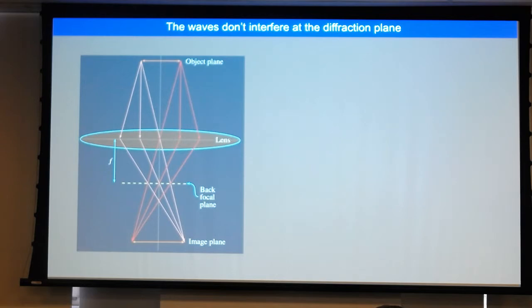Of course, when you run the microscope in diffraction mode, what happens is that you have another lens down here that focuses at this plane and gives you a magnified view of that plane. So that's all the diffraction mode. Is that what you wanted to know?